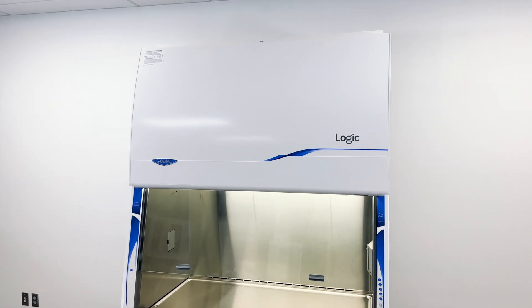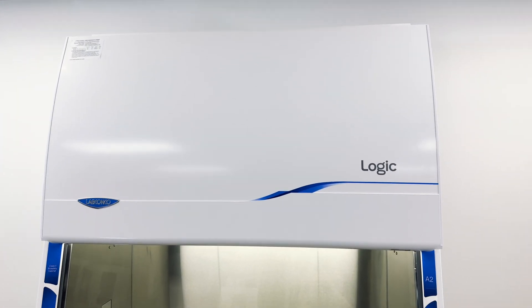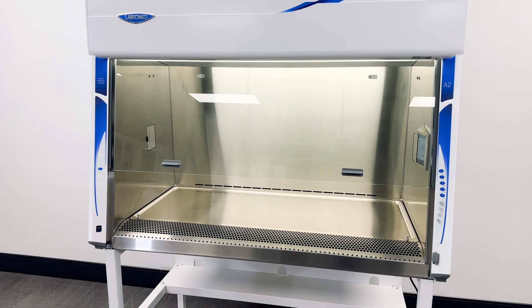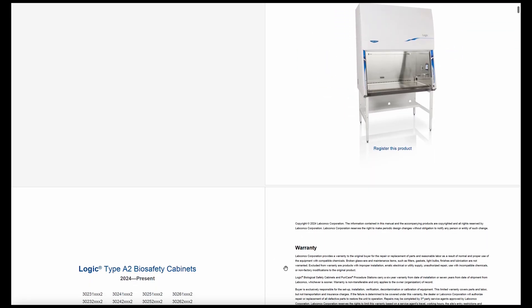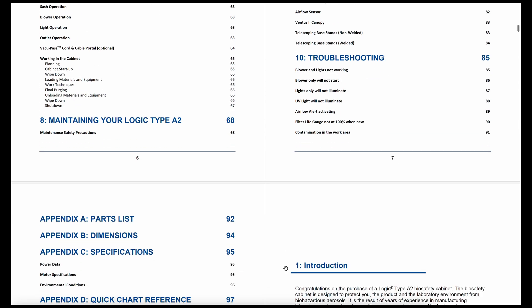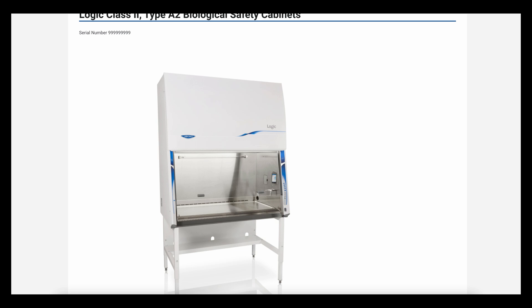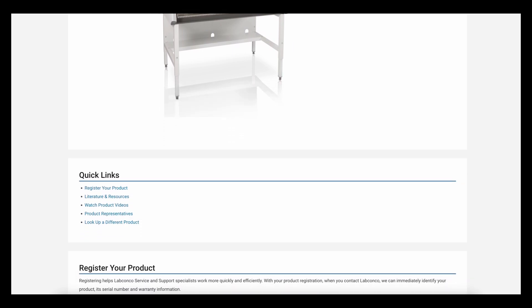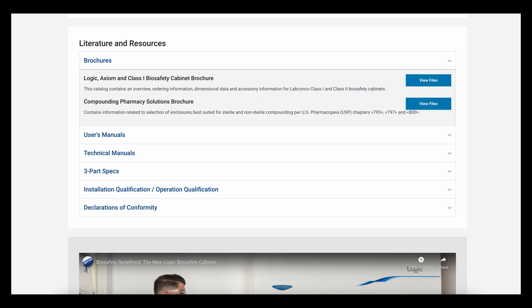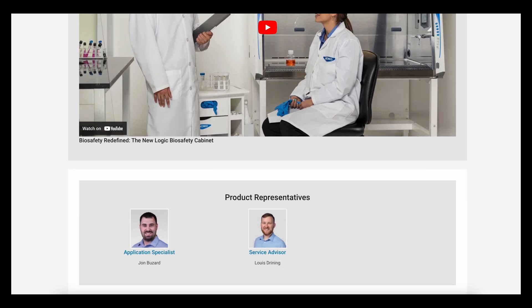Congratulations, you've just completed the installation of the Logic BSC from LabConco. Before initiating work, have your BSC certified by an accredited certifier. Users should also familiarize themselves with the manual located on the USB flash drive included in the parts box. The info tag on the serial tag will lead you to a website where you can register your product, connect with application support, or obtain product-specific information like your factory test report, IQ OQ documents, and the latest copy of the user's manual.